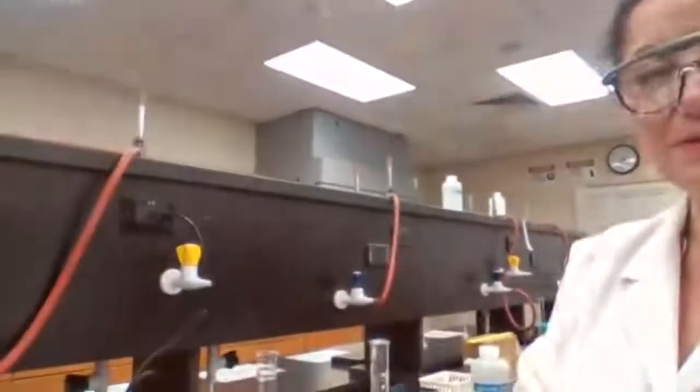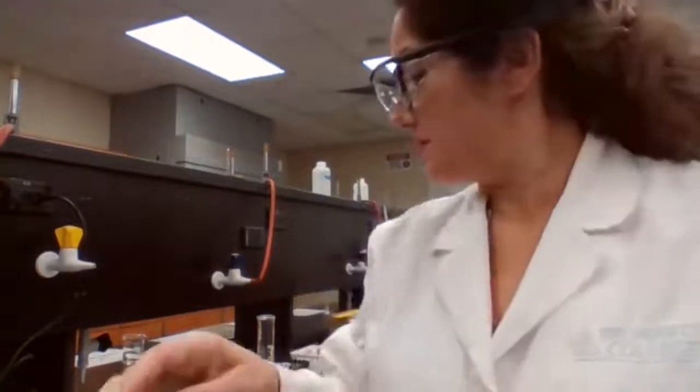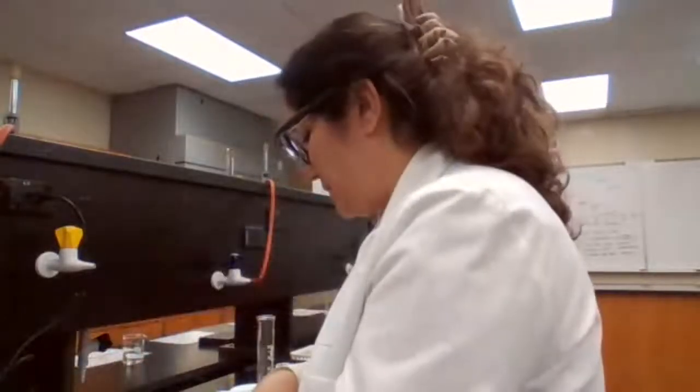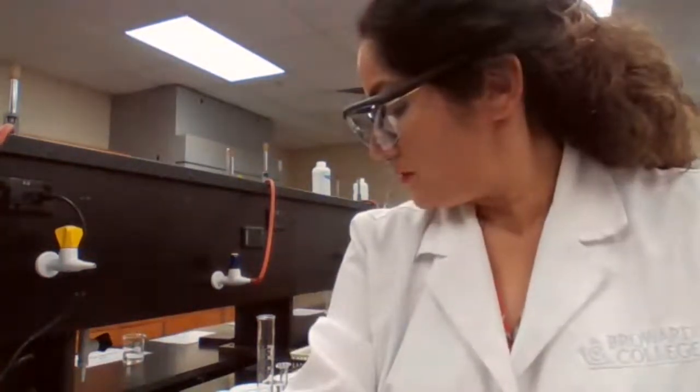Okay, we managed to get through the 15 minutes of waiting time for the calcium chloride. We're measuring the calcium chloride before, and it's 5 point. The mass of the weighing paper is not there, so I have to get the mass of the weighing paper out. 5.212 grams after it sits out for 15 minutes.